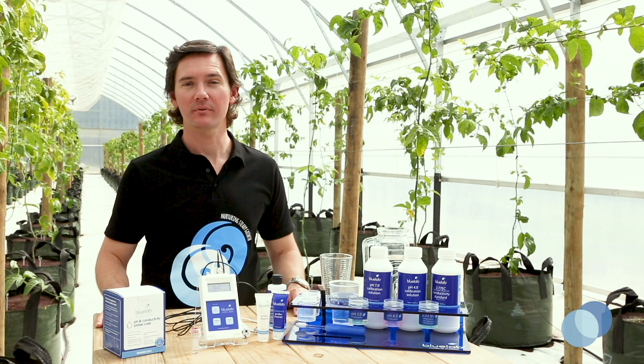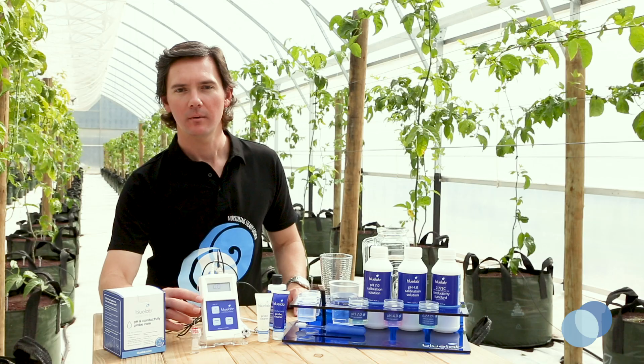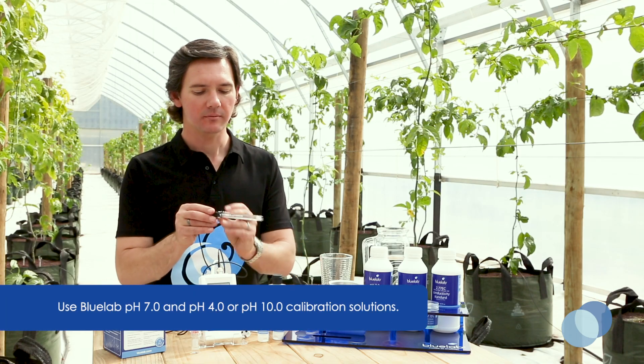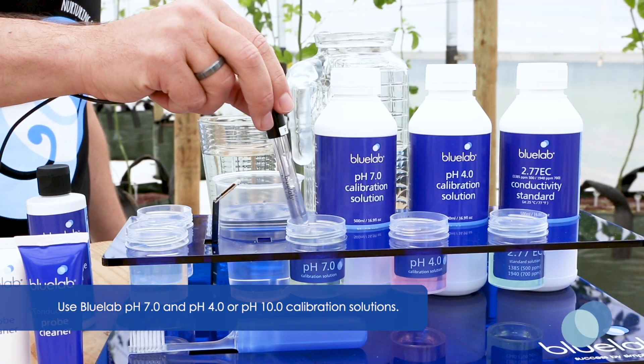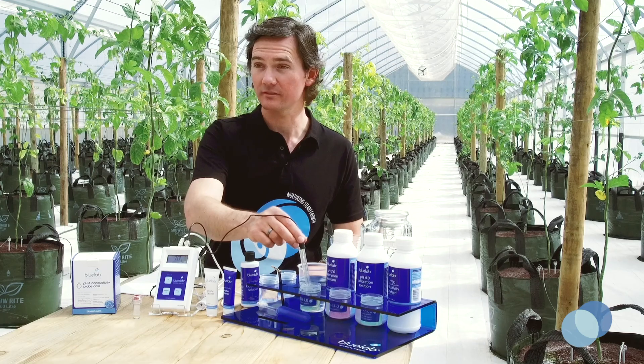Now we're ready to calibrate the pH probe. Press any button on the combo meter to turn it on. Press the pH button to make sure you're in pH mode. Take the pH probe and stick it in some fresh pH 7 calibration solution. Give it a good swirl to make sure you've got good contact between the probe glass and the solution.